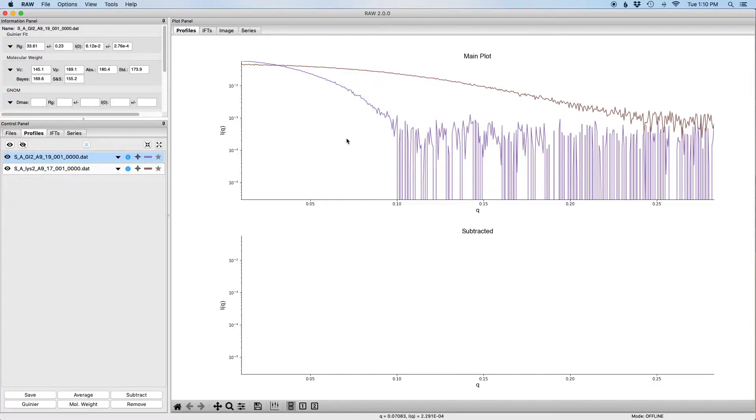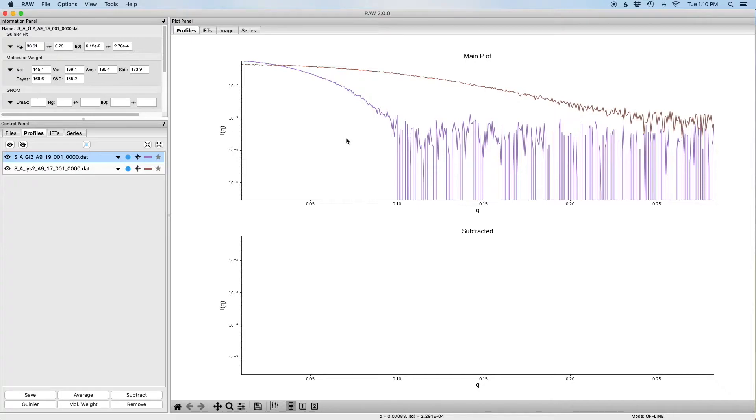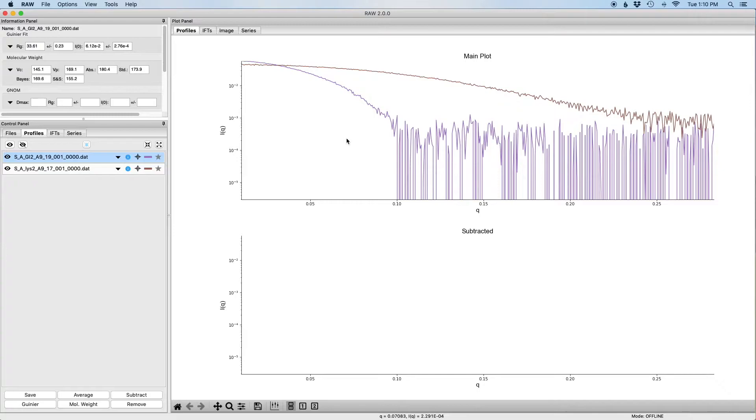This tutorial assumes that you have the results of previous tutorials, particularly the subtracted and Guinier analyzed glucose isomerase and lysozyme data files from the tutorials for loading, averaging and subtracting data, Guinier analysis, and molecular weight analysis.